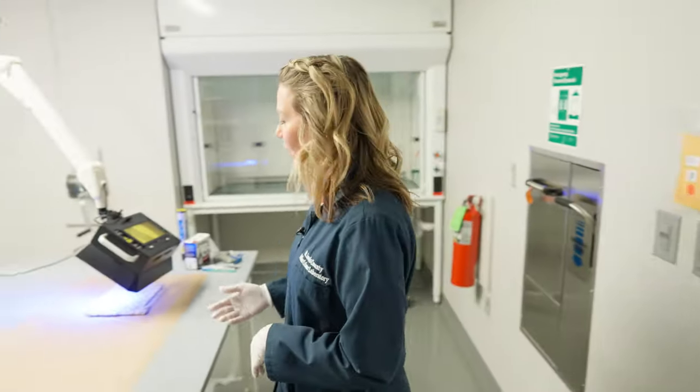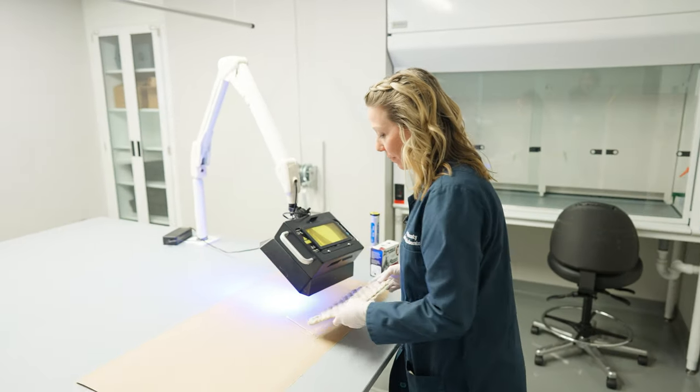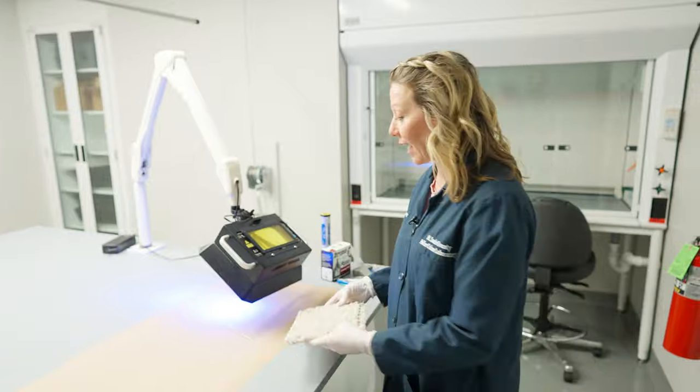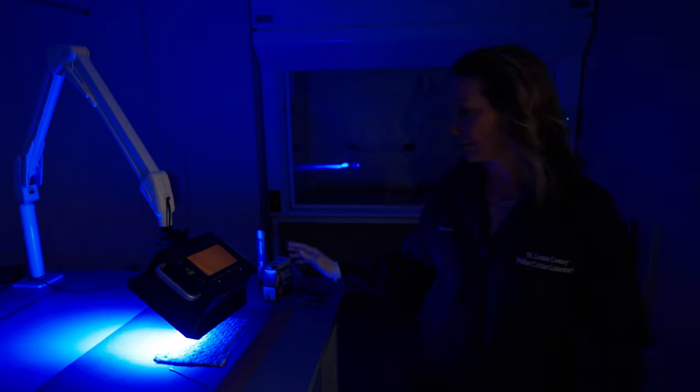Let's take a look at some of the tests the biologist performed to identify bodily fluids. For example, this piece of carpet, you can't see anything with the naked eye. But when we use the alternate light source, as you see, the stain becomes visible.